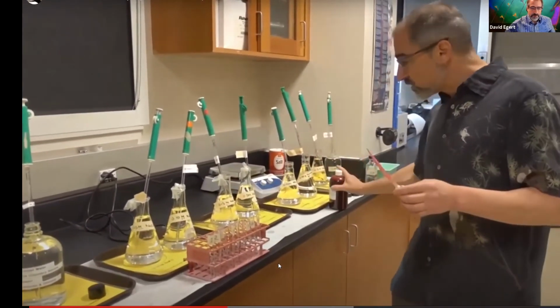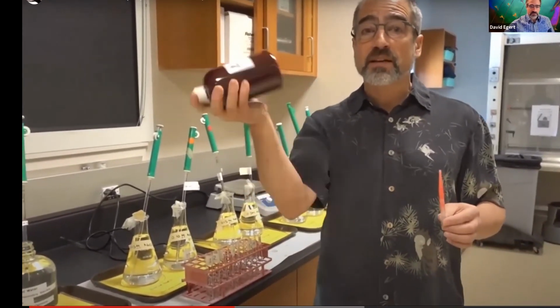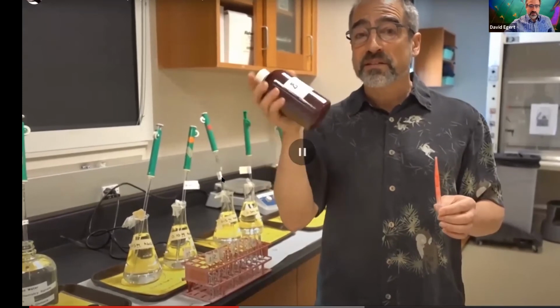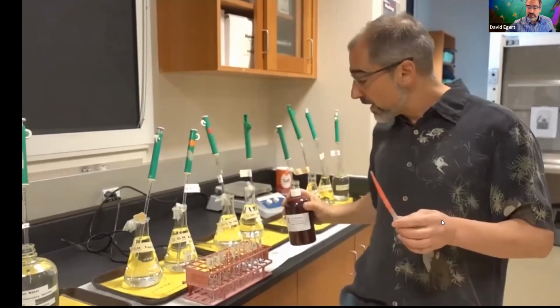And now each test tube is going to get 6 drops of the blood. Like I said, make sure it is well mixed. Of the different kinds of mixtures we talked about, what would you call blood cells and plasma? Suspension. That's a suspension. So if it's just been sitting around, all the blood cells are sitting on the bottom. So you've got to make sure you shake this thing up. Otherwise, you're just going to get mostly plasma and not get the cells. In a suspension, you're going to have the cells falling out.